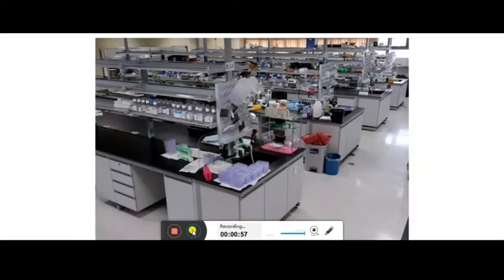Here is your chemistry lab. Once you see here, so many bottles are kept, so many materials are there, so many glasswares are arranged in a proper way. One by one we will study the different laboratory apparatus, what their uses are, and how you are able to handle them. We will learn how to use them to the maximum and how to take care of them. So one by one we will go through this.